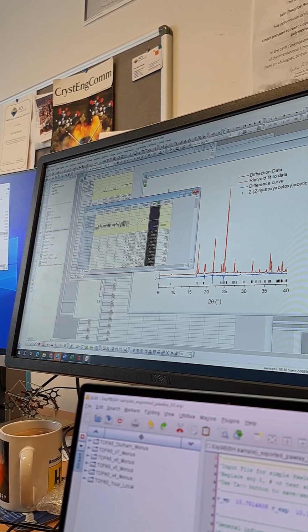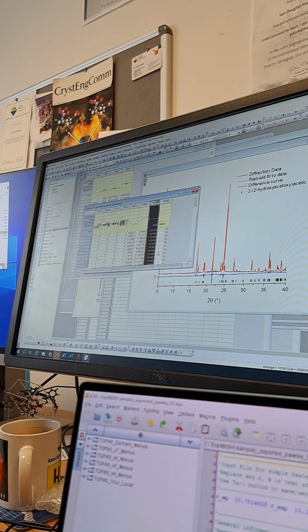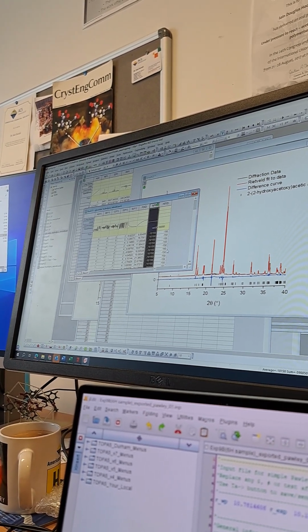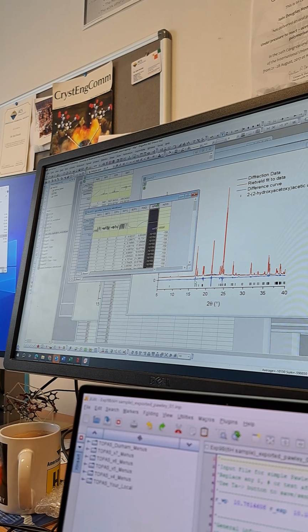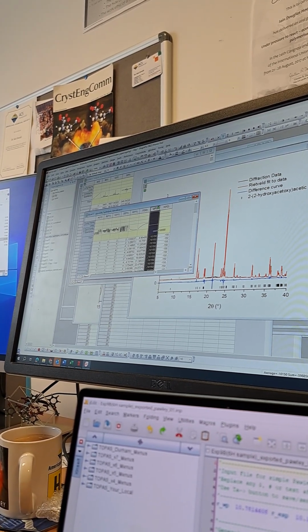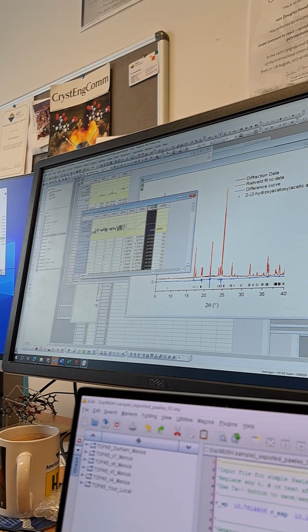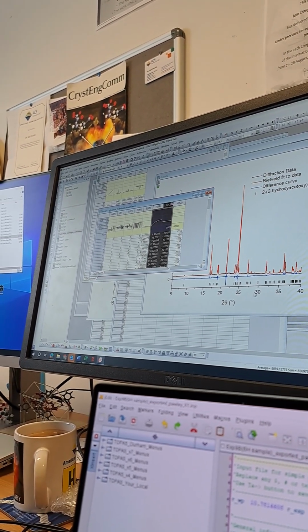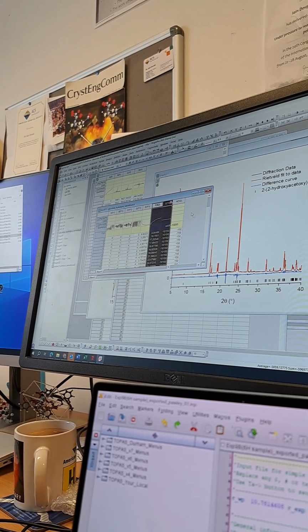So I've set it to be 150, or I've maybe output it to be 150. That wasn't good enough. That was too close to this blue line. So what I've done is I've added in a column here to the left hand side, so that I'm able to select it like that and drag it in, for ease of use.